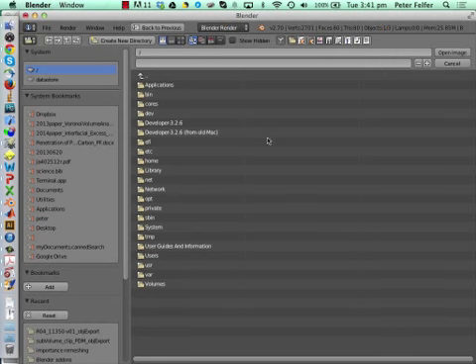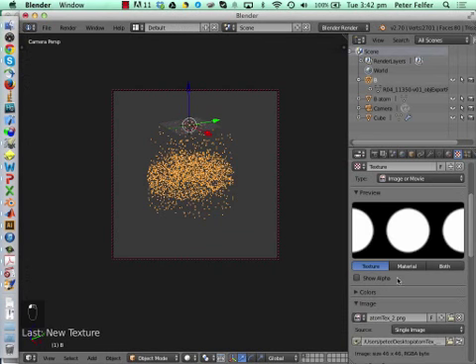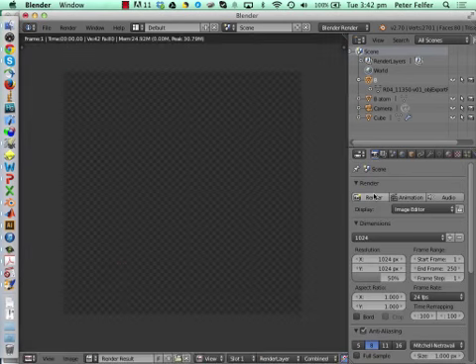And you open one. I've got some pre-made ones which are just black circles with white interiors that I've created in Illustrator. It's not very hard to do. Saved it on my desktop. Usually I've got my standard one that I'll open here. You can see that, show alpha. So our atom is rendered as this. So it just puts this image wherever there's an atom.